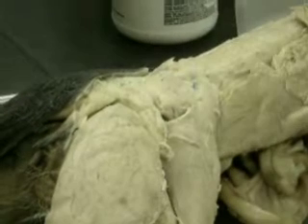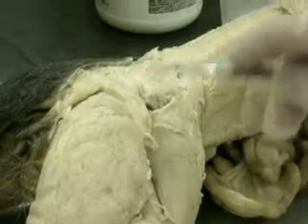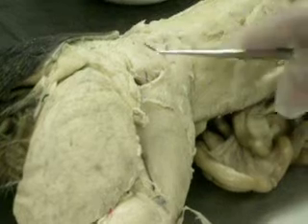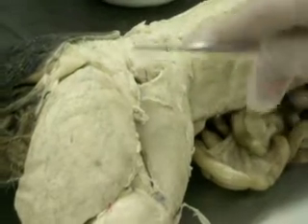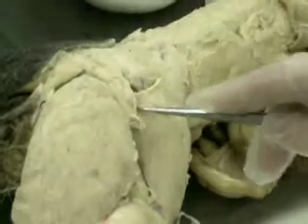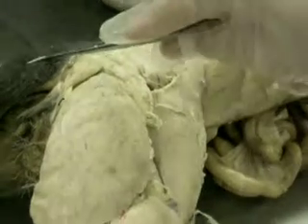If you combine it with the caudofemoralis, it's not that small. So again: gluteus medius, gluteus maximus, caudofemoralis — because 'caudo' refers to the tail, right?